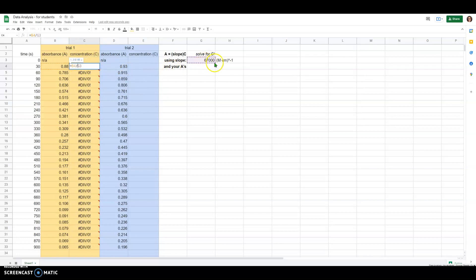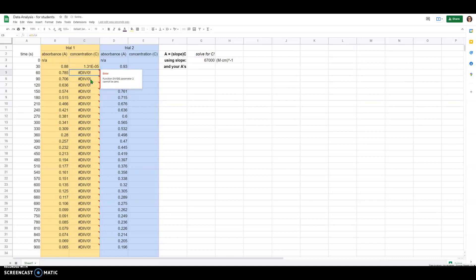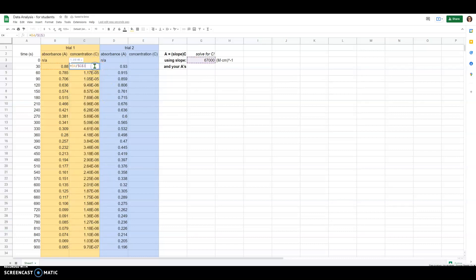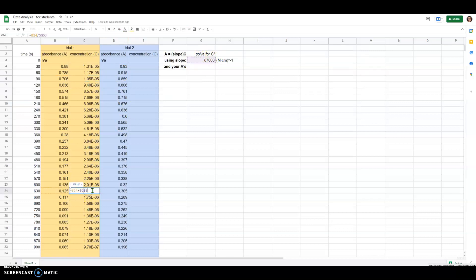To fix this, go back to the original equation and put a dollar sign in front of both the letter and the number for that cell reference — that tells the spreadsheet to always grab the same cell for the extinction coefficient. Hit enter, then copy this down the column again by dragging. Now it works: each cell takes the absorbance divided by the same absorption coefficient, and going down the column it still grabs the correct extinction coefficient.